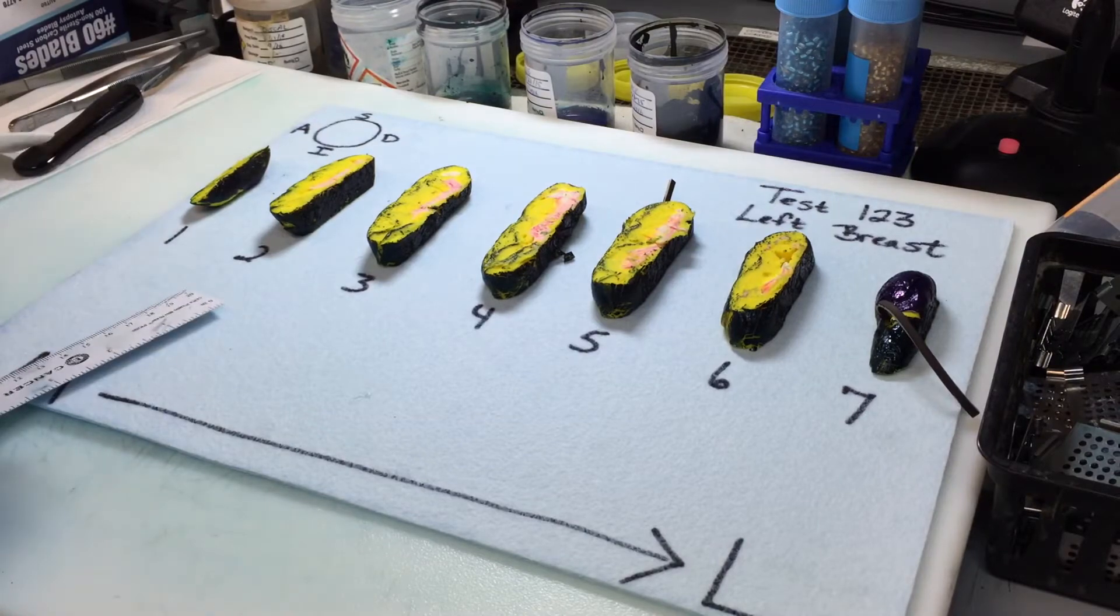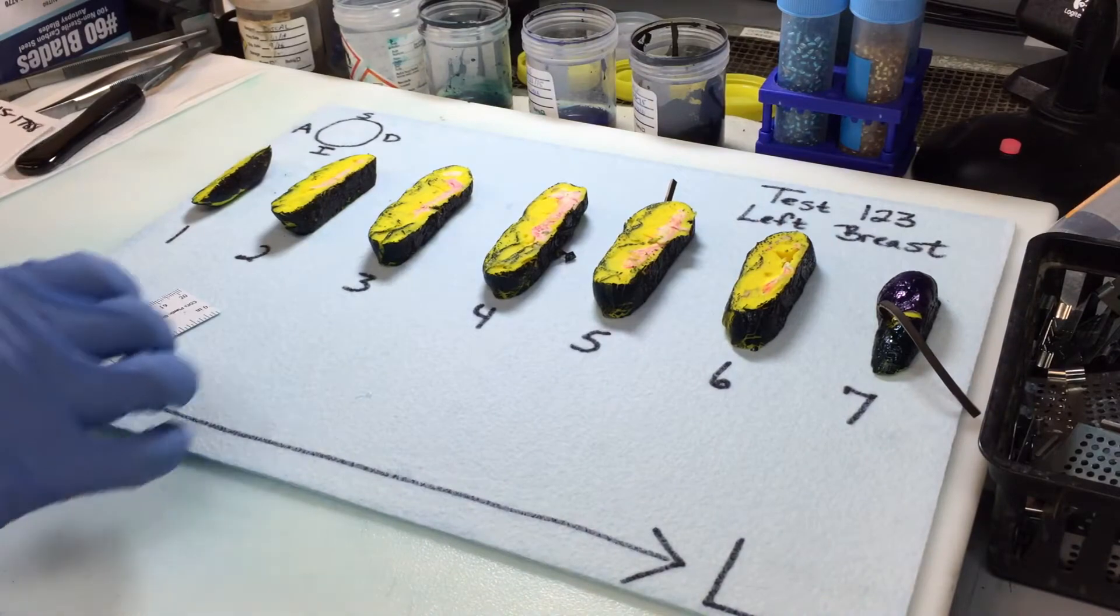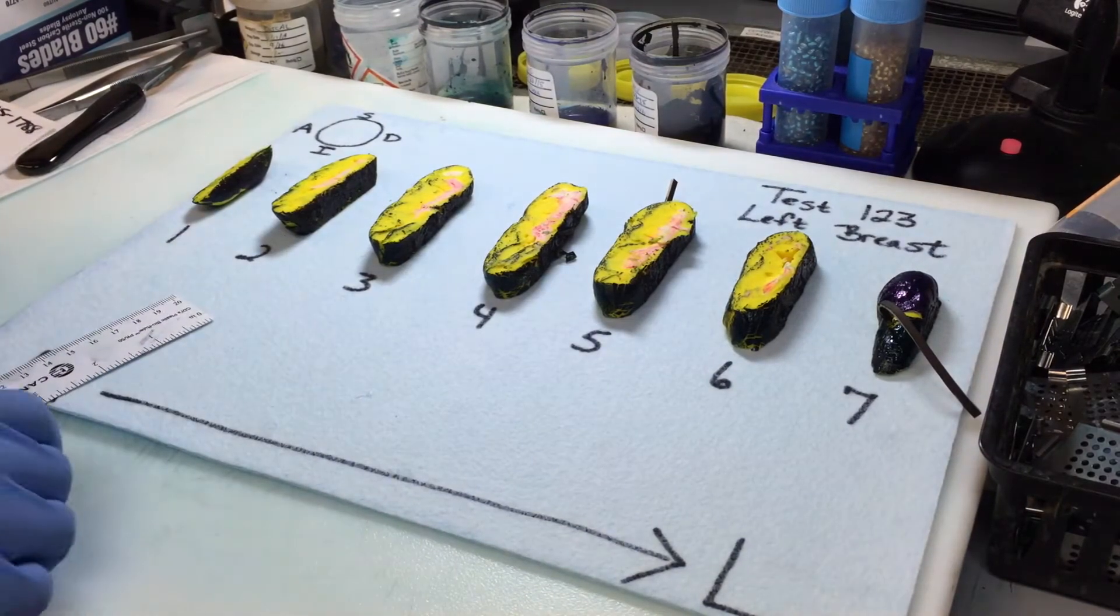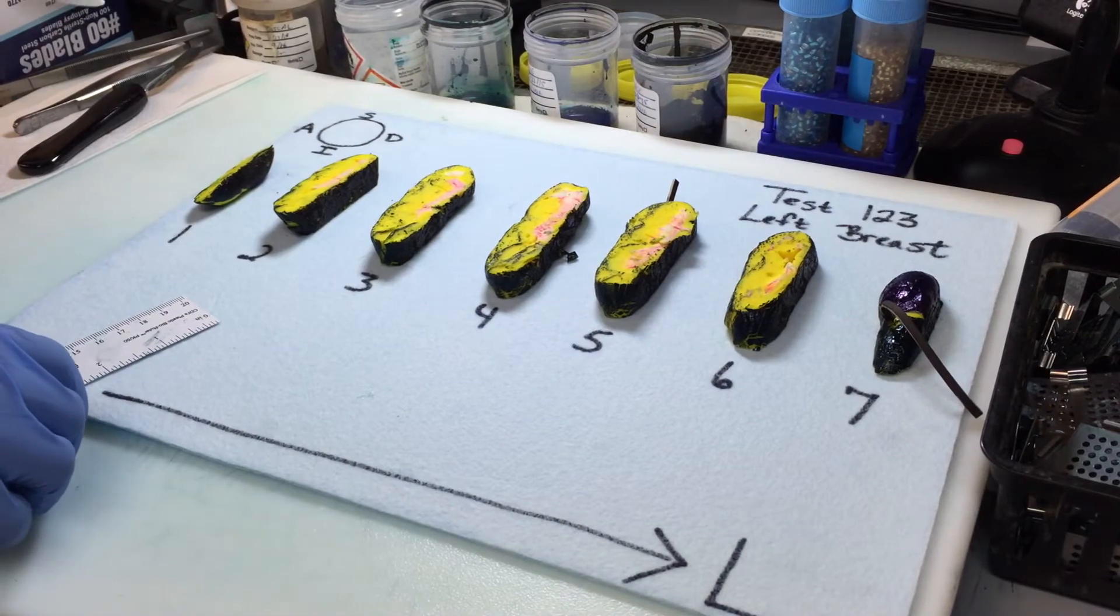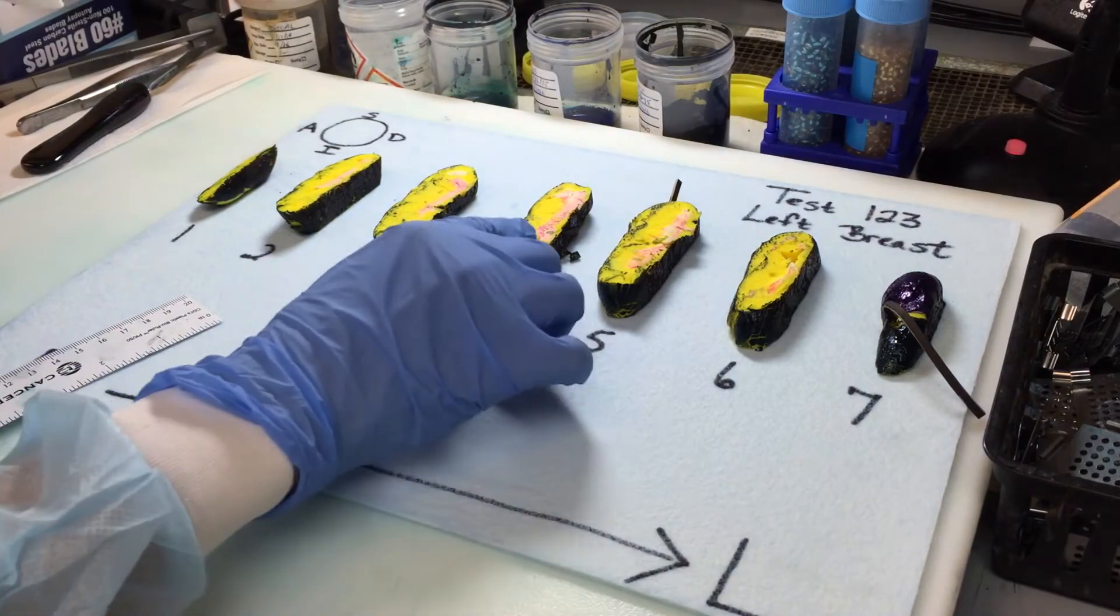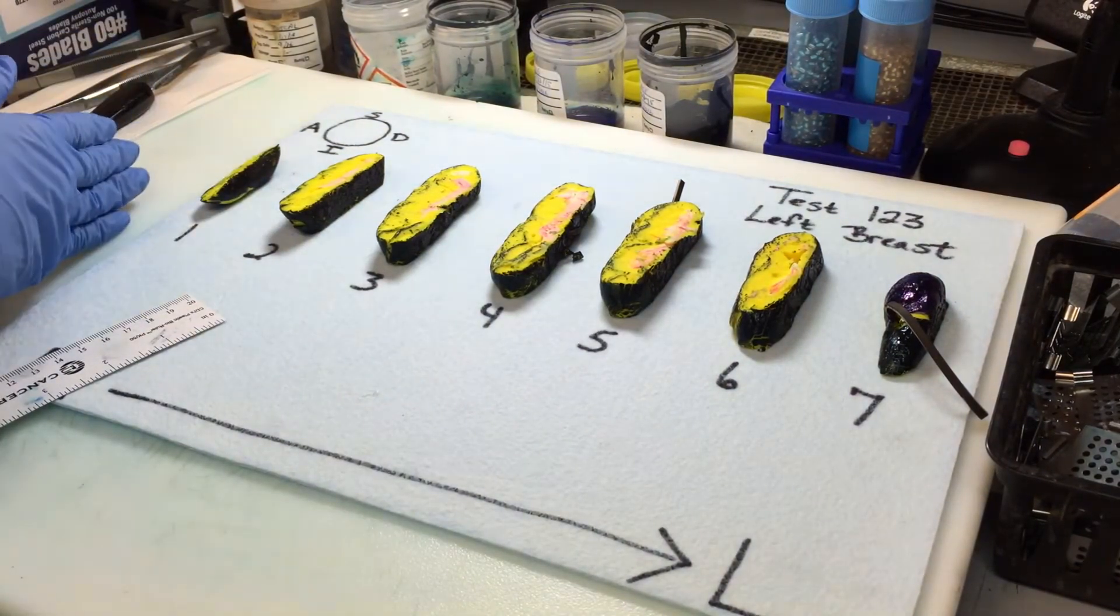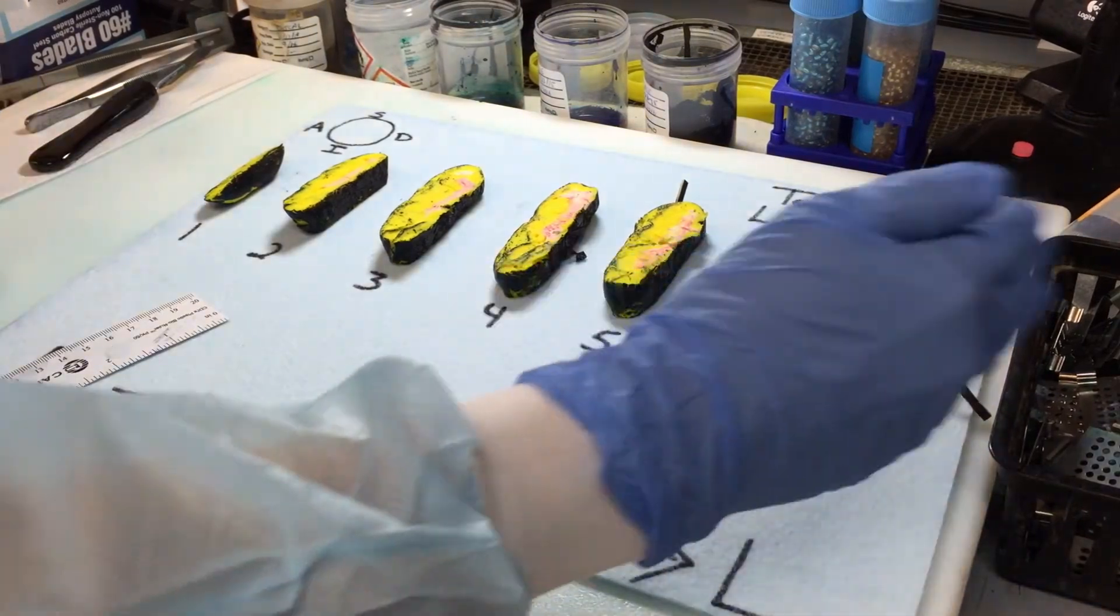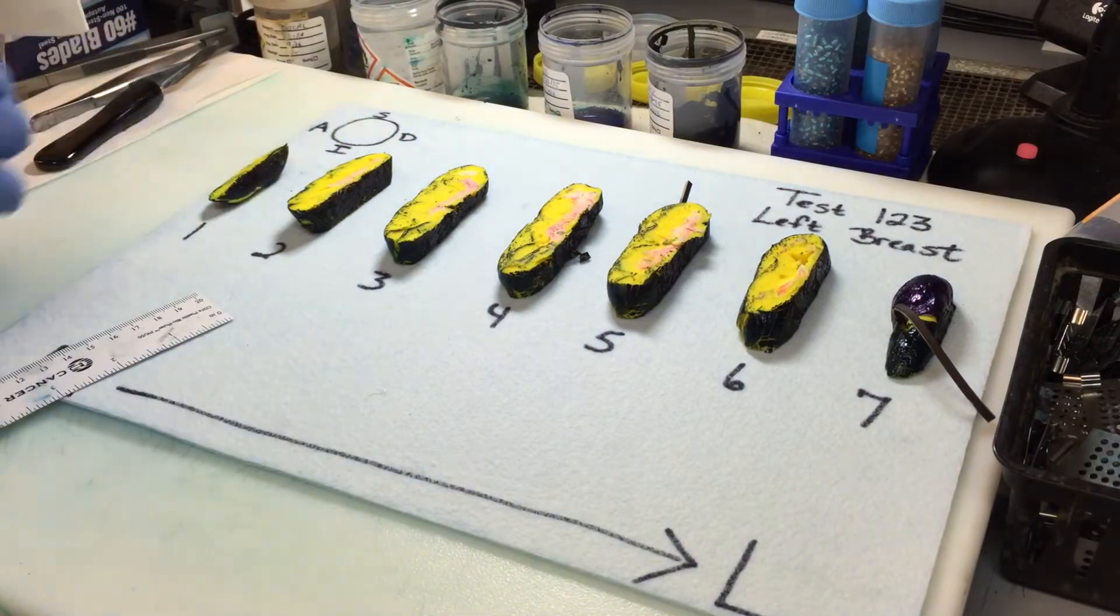So we also want to note the tumor from each margin. So you look to see on which slice it's the closest. And we've measured for the deep margin on slice three, it is only 0.1 centimeter away. The superior margin we can see is 0.5 centimeters away. The inferior margin is 1.2 centimeters away. And then from the medial margin, it's 1 centimeter as well as the lateral margin is 1 centimeter. And the anterior is 1.2 centimeters.